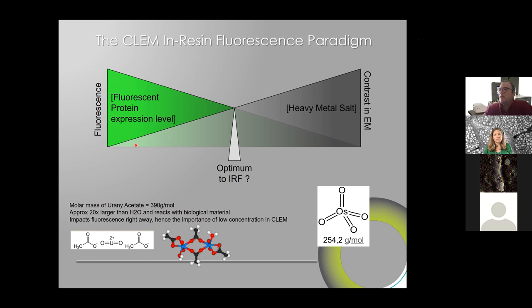So there is some kind of optimal situation where the addition of any fixatives or stain will start to decrease the fluorescence. But this is also what gains you a significant contrast in TEM.